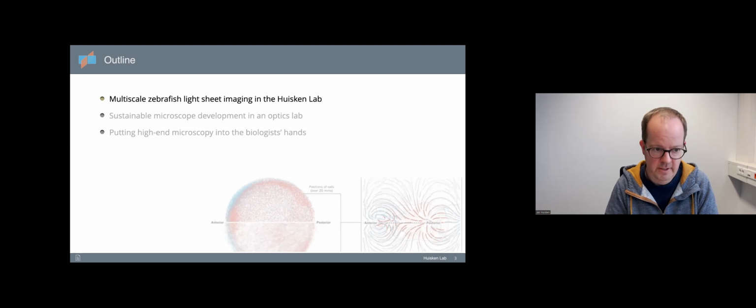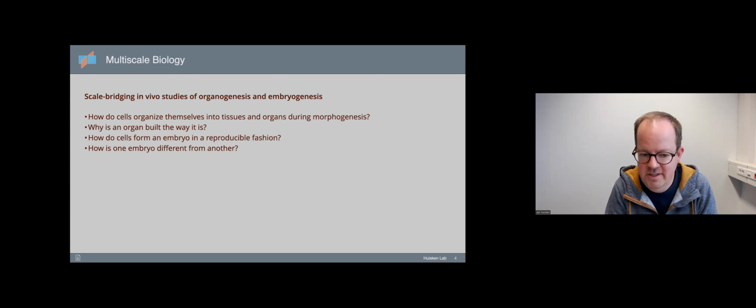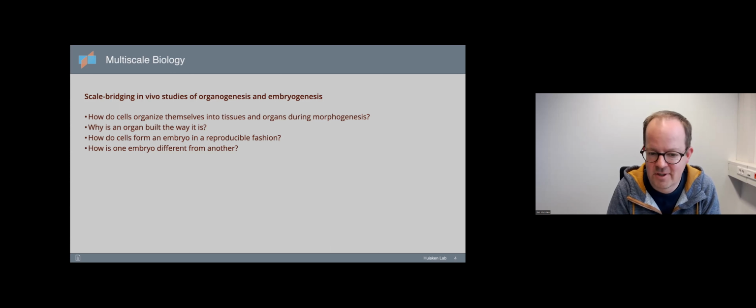So on to the first part. So just as a quick introduction to the questions of the lab. So we basically, as I said, a multidisciplinary lab, mostly biologists and physicists. Biologists come up with some interesting, exciting questions, and then the physicists try to build the best possible microscope for these questions. And so on the biology side, it's mostly sort of this multi-scale aspect of development, whether it's organogenesis or embryogenesis as such.